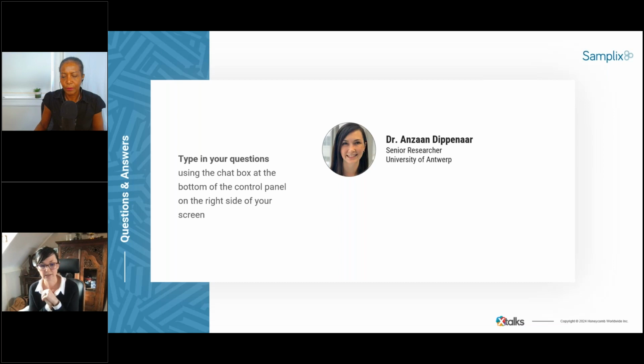The disadvantages, I would say, are the higher error rates of ONT sequencing, although there has been a lot of improvement in this area. That in combination with some of the errors in dMDA at very low input amounts is something that we need to be cautious of and understand better, I think. Another disadvantage of ONT is possibly the high per sample sequencing cost. I think that compared to something like Illumina, it's still quite expensive.